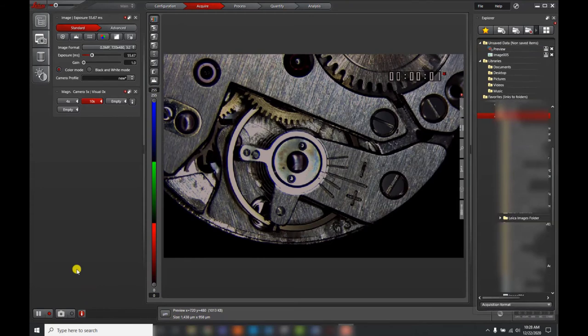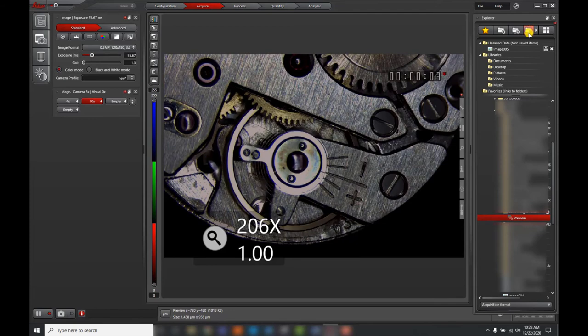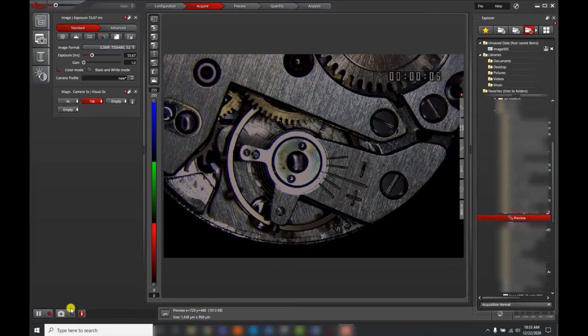To turn off the name saving auto prompt, you need to set the acquisition folder button within the folders tab to a folder that you automatically want to use when capturing an image. Once you've selected this, it won't prompt you to give the image a name. The last thing I will share is how to add a scale bar and distance measurements.